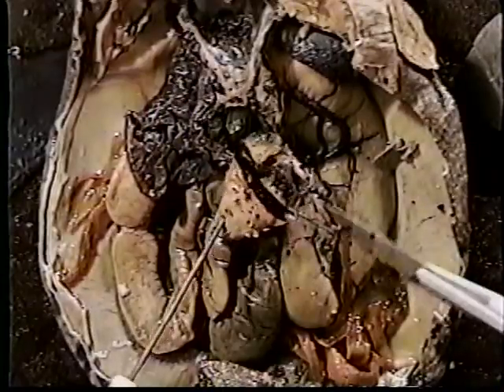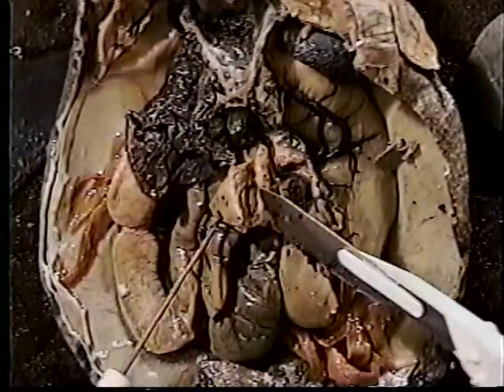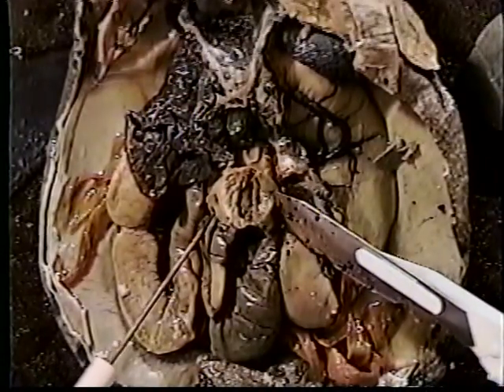We should keep in mind also that the heart is a very effective muscle. And as we go down toward the ventricle end of the heart, we notice a mass amount of muscle tissue.